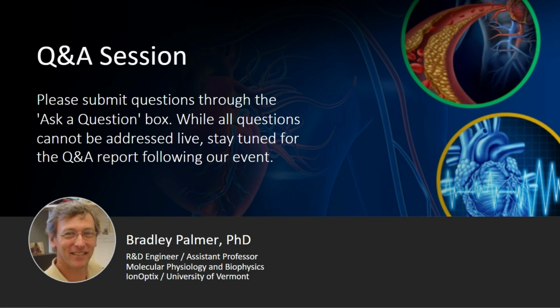It's basically a personal preference. We tend to use them anywhere between 100 and 300 microns thick. I like to use them around 200 because then I can visualize sarcomeres. We can consistently visualize sarcomeres with 200 micron thick. We cannot consistently see them with 300 micron thick. So I tend to use the 200 micron thick.